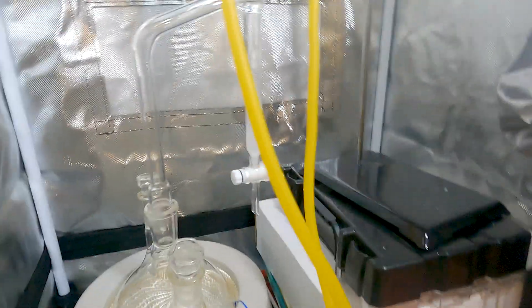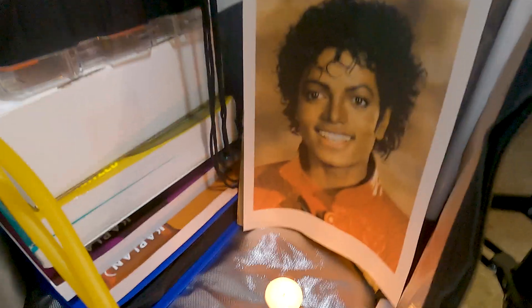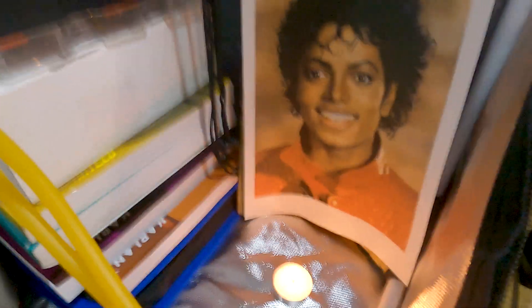So of course to honor that, I've made a Dean Stark Shrine. Thank you, Dean Stark.